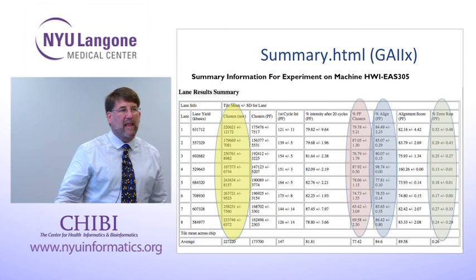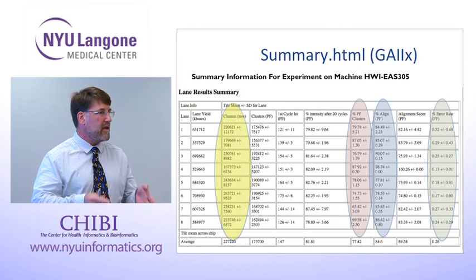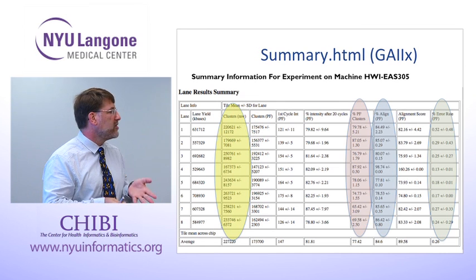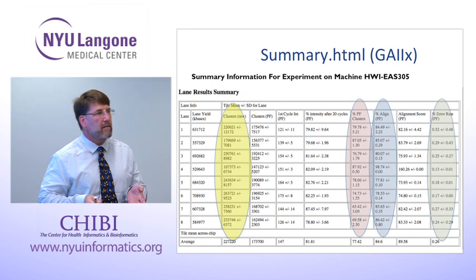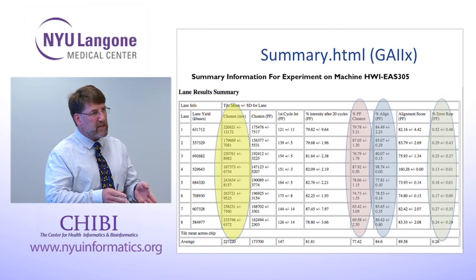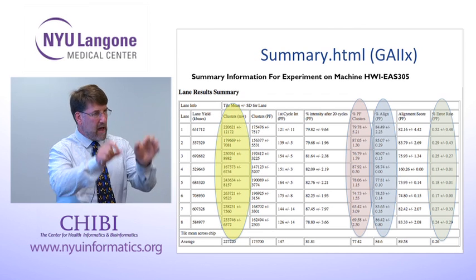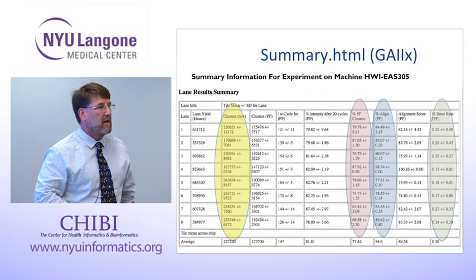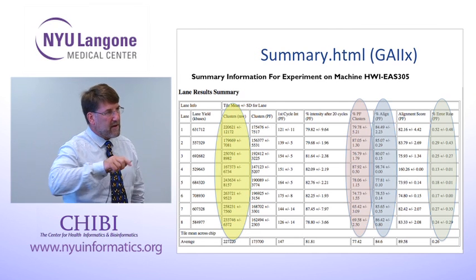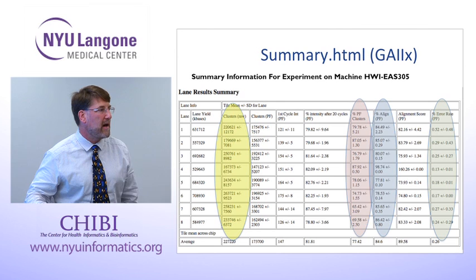Also, we calculate an alignment percentage. That means how many of the reads that you produce match the reference genome of the organism you're interested in. In an RNA-seq situation, we also have to deal with gapped alignments, matches that contain introns. You've sequenced the cDNA, now it aligns, but in 2 parts. And that's a challenge for the alignment software. And several different software packages approach this in different ways, which I'll talk about later.